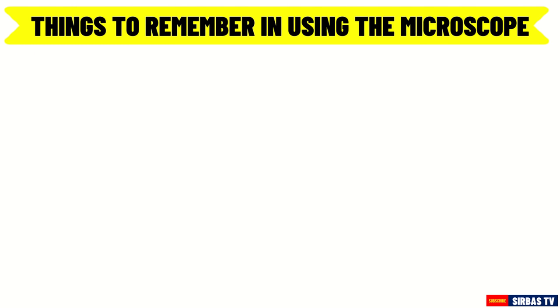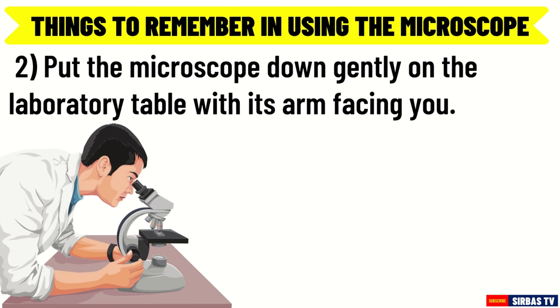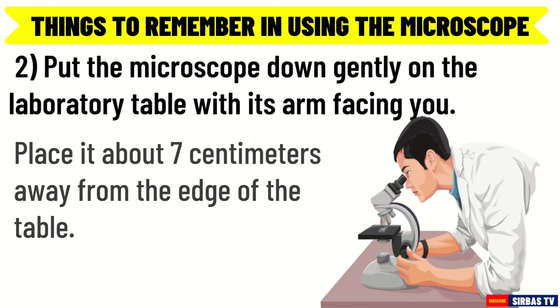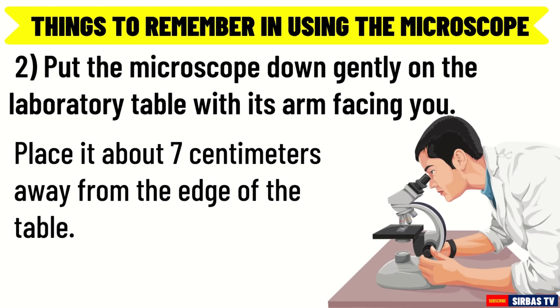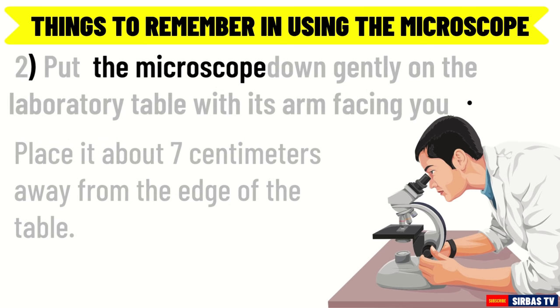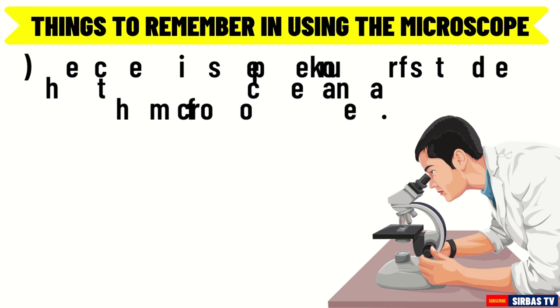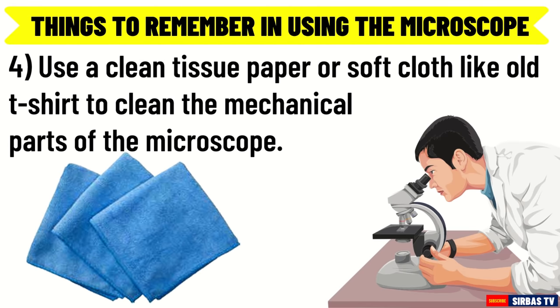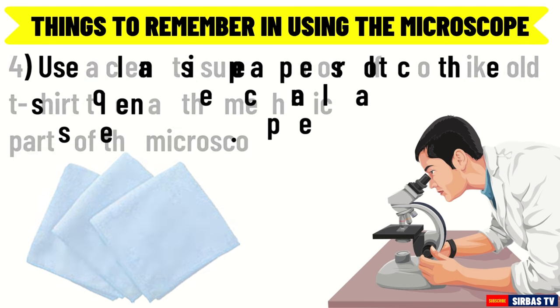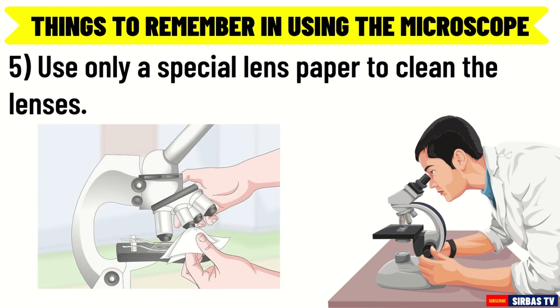Number 2: Put the microscope down gently on the laboratory table with its arm facing you. Place it about 7 cm away from the edge of the table. Number 3: Check the microscope before and after use. Report any missing or damaged part to your teacher. Number 4: Use a clean tissue paper or soft cloth — like an old t-shirt — to clean the mechanical parts of the microscope. Number 5: Use only a special lens paper to clean the lenses.